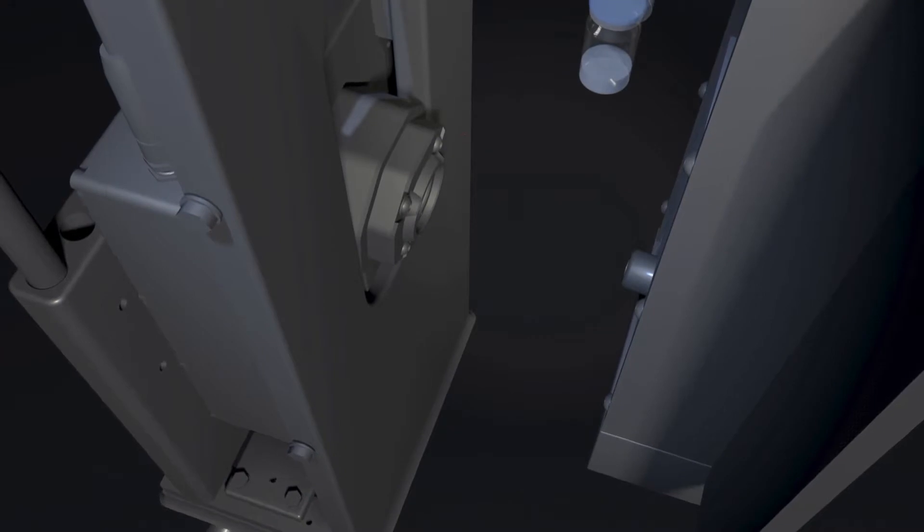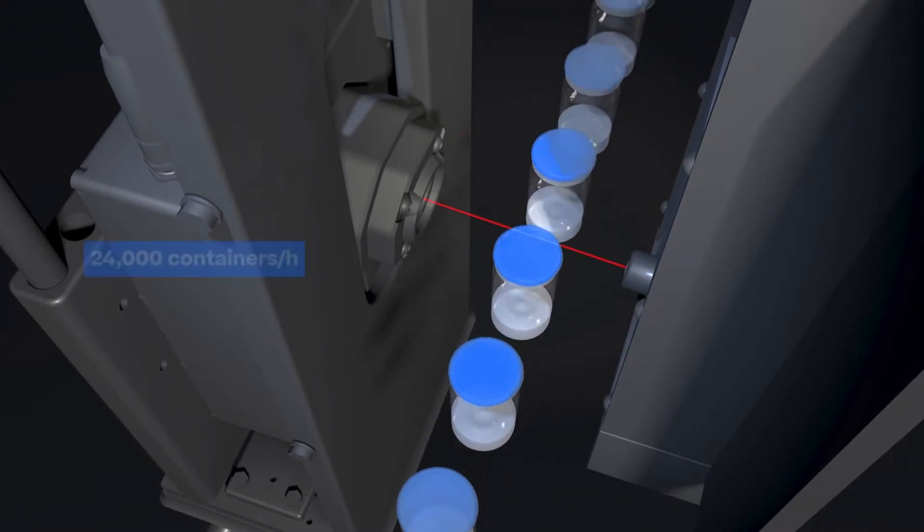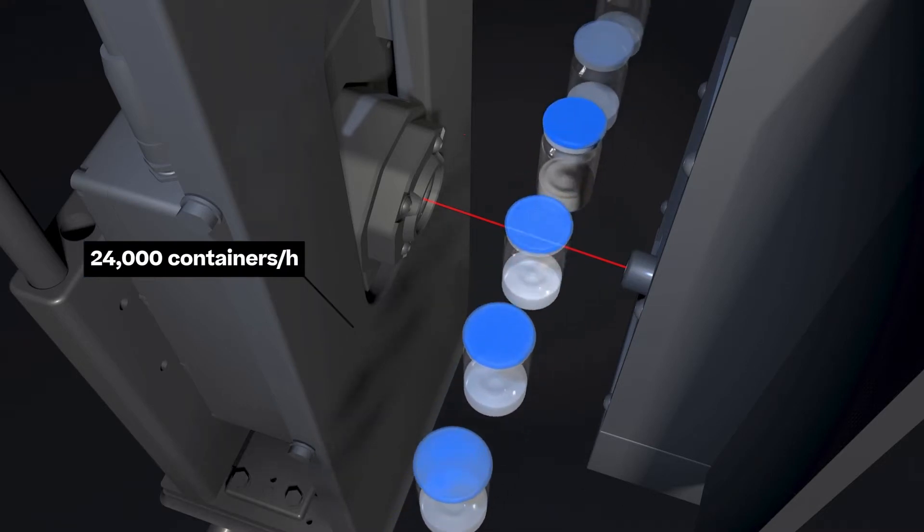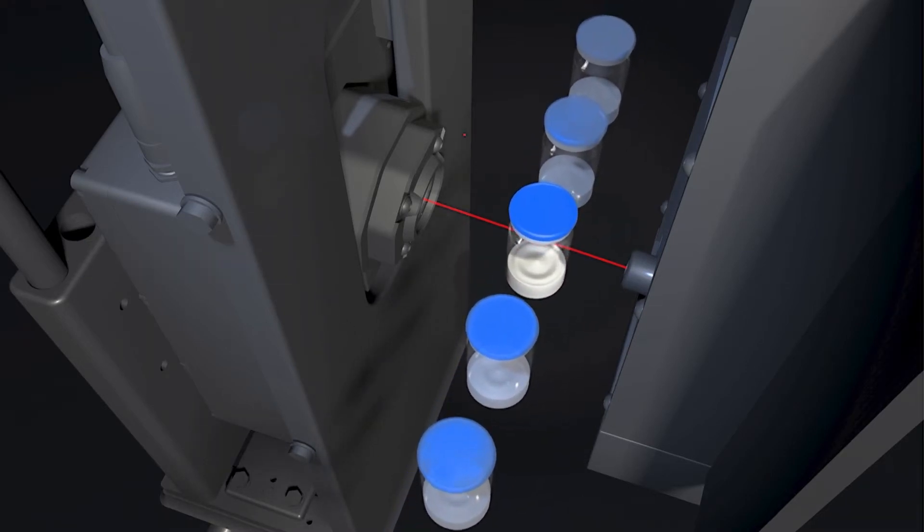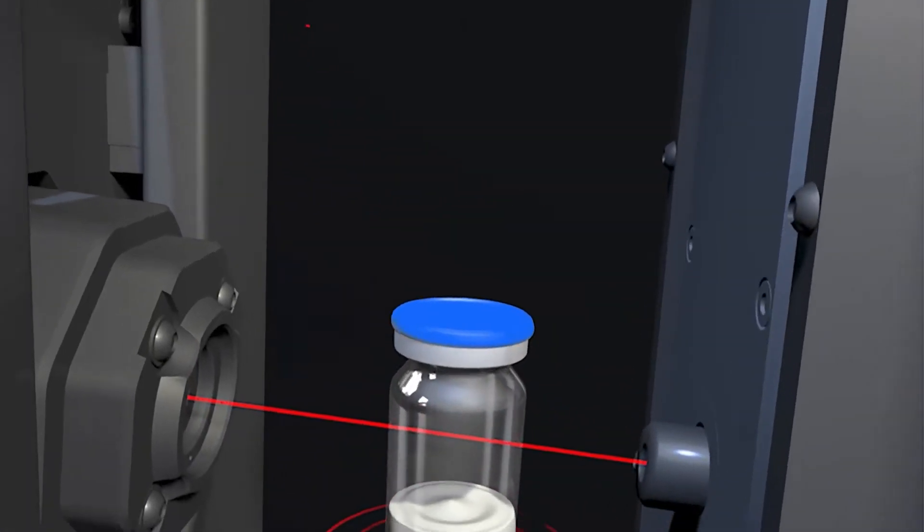Our oxygen-based headspace analyzer detects the tiniest leaks in containers filled with a lyophilized product. Defective containers are removed before they would be further processed. This inspection method can detect leaks indirectly by analyzing the gas within the container.